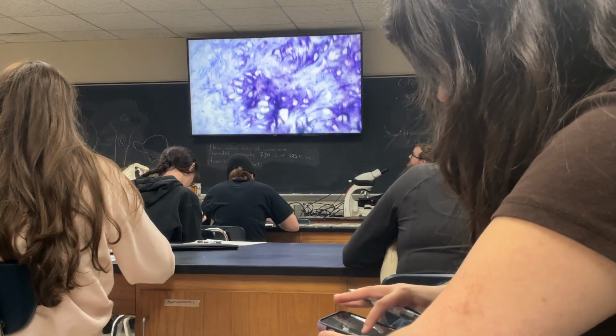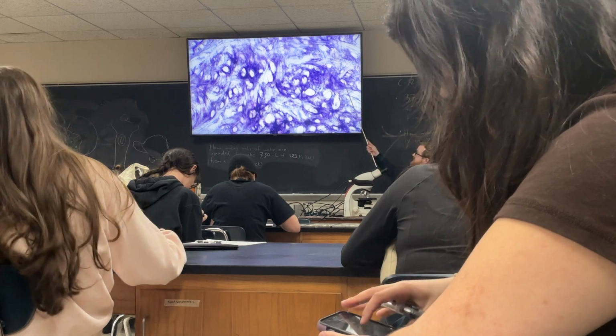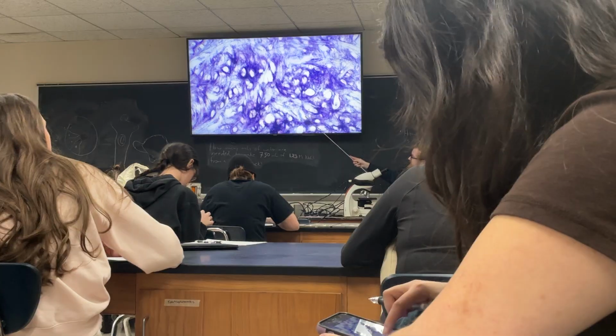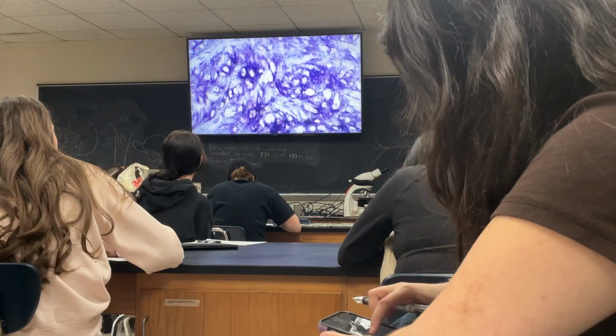Those are lacuna where the cells are. So in some of the samples, like this one, I do see some cells, right? But that's empty, that's empty, that's empty. Sometimes it'll just look like empty holes. That's where the cells used to be, but they got pulled out during the process.